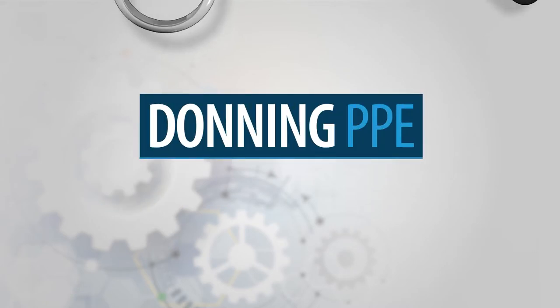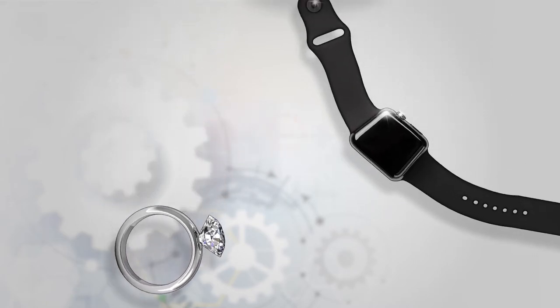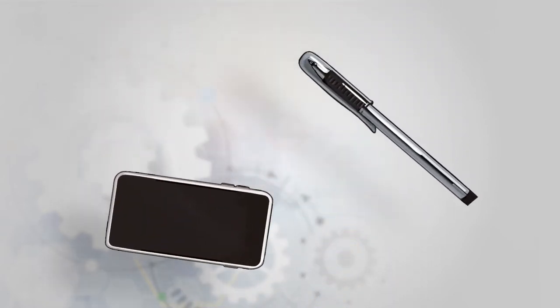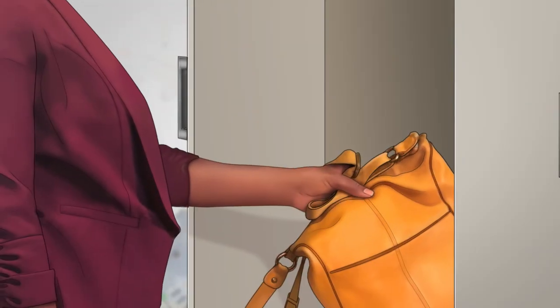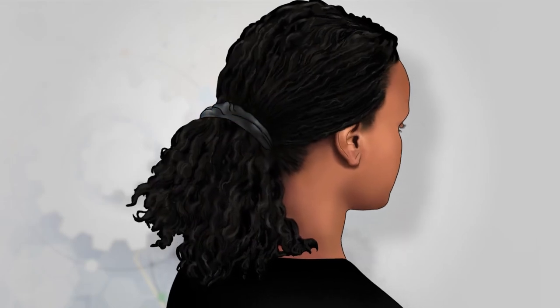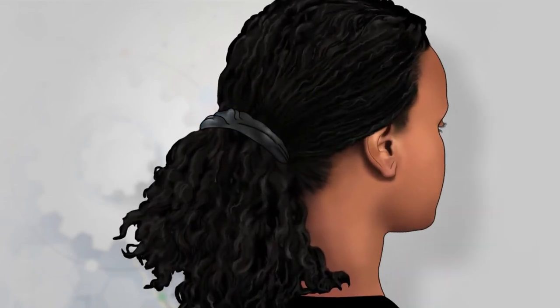The first step is to remove personal items, such as jewelry, watches, coats, jackets, cell phones, pens, or additional bags, and place them in a location outside of the laboratory. Then tie back any long hair if present.